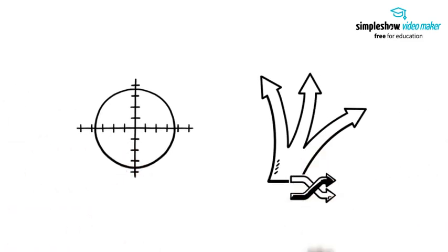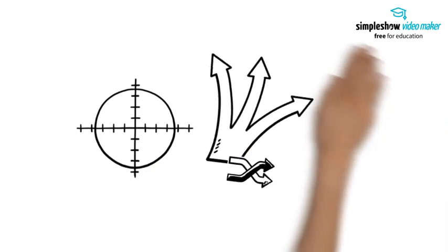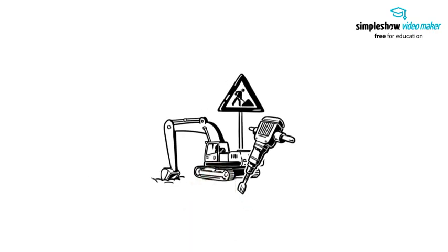The compound microscope finds its application in various fields, from biology to geology, revealing the intricate details of cells, minerals, and more. Its construction and usage are a testament to human ingenuity, enabling scientific advancements.